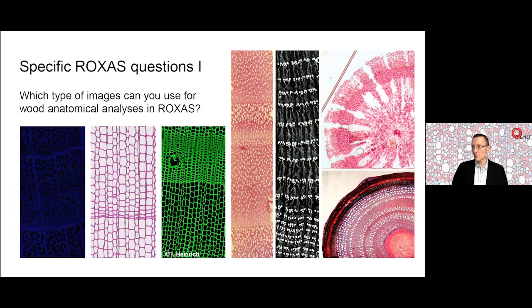We see a surface scan with the oak and the chalk that was rubbed into the larger vessels. In the left corner, we see a fluorescence image. There you would say contrast is really poor. However, what is nice there is that the target feature is really black, truly black, and all the rest is a type of bluish color.